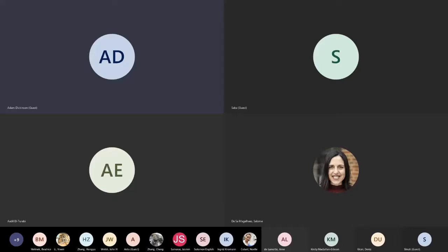Once you find an area which is good, you can inform the software to look for these particular regions. That will take some of the guesswork out of it. You may have seen me navigating around the grid, trying to find good areas, and there are some bad and some not so good. That will help automate the process and make that decision for you, and it will then fixate on those areas and image them. I hope that does answer your question in some way.